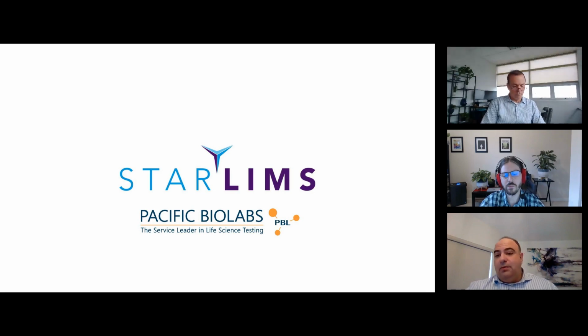to actually audit them before they sign a contract, right? Because you want to look at your total cost. When you make the investment in the LIMS system, you want to make sure it's of the highest quality. And one of the ways to do that, to reduce your risk as a lab, is to make sure you're dealing with a vendor that has a robust quality management system in place. As to the actual cost, I do know that it varies, but I don't know if Brandon, you have a better answer to that.